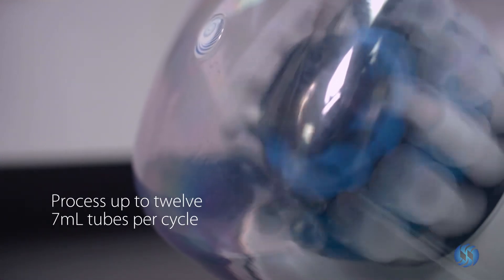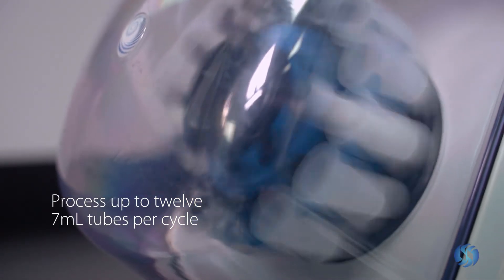The BeadRuptor Elite can process up to 12 samples in a single run when equipped with a 7-milliliter tube carriage.